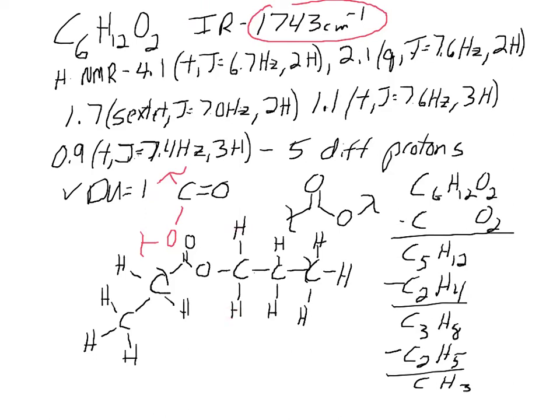We have another CH2 that's very de-shielded at 4.1, which means it's usually next to an oxygen. That's split into a triplet, so how many nearest neighbors does it have? 2, so that matches up. This CH3 on the end should be turned into a triplet when we see a CH3 next to a CH2. Now what about this guy? How many nearest neighbors do these hydrogens have? 5, so it's going to be split into a sextet. Does everything match up? Yes.